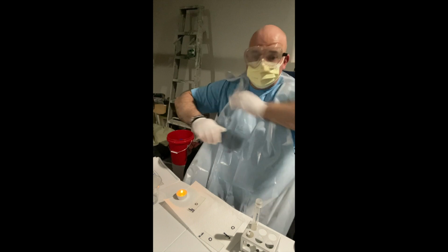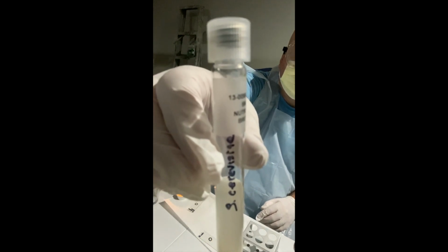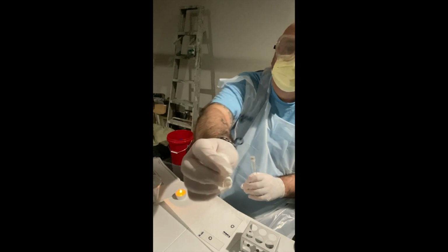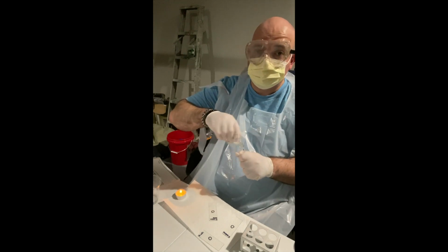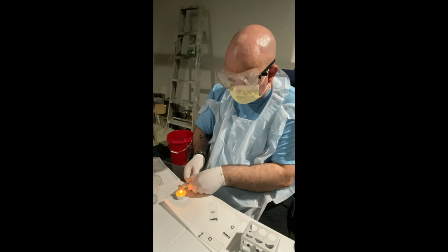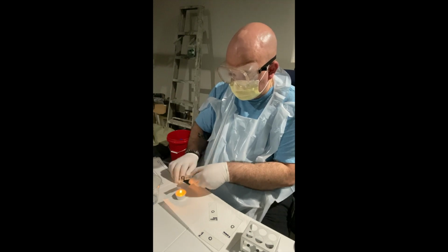Okay, so my last culture here is my S. cerevisiae. This came from yeast. This is my S. cerevisiae slide. So lid off. And then I'm going to flame the lid, give me the tip of the tube here. Okay.